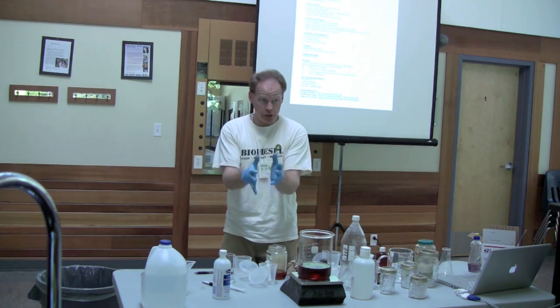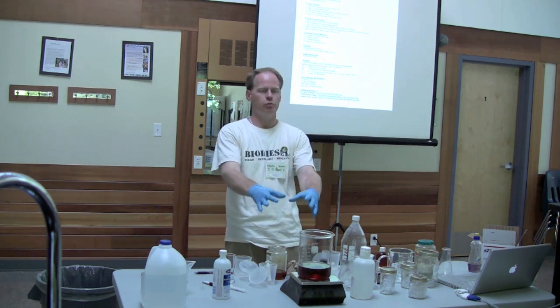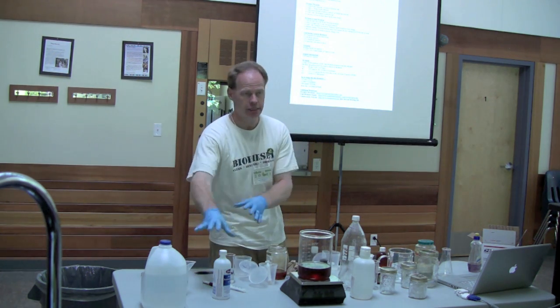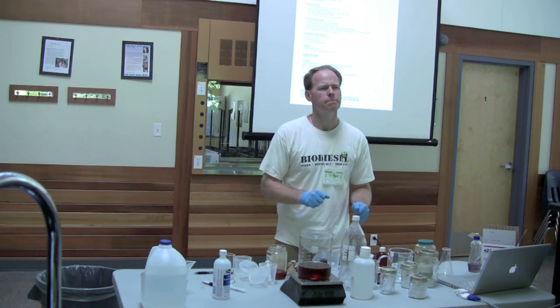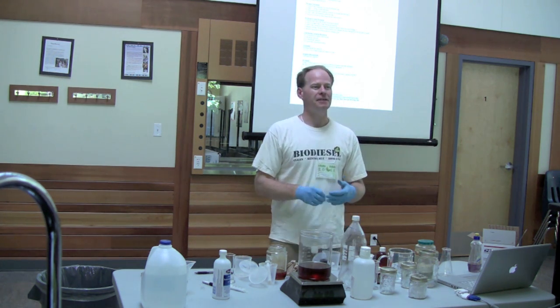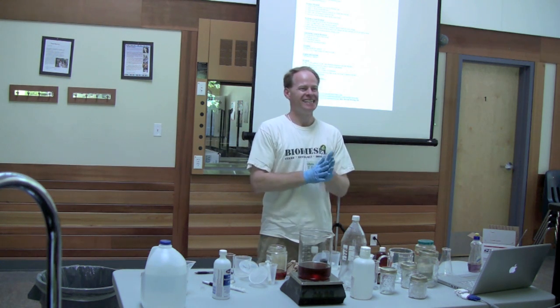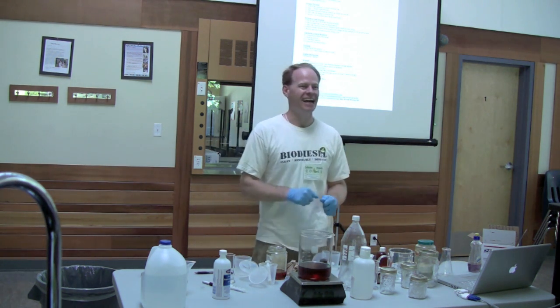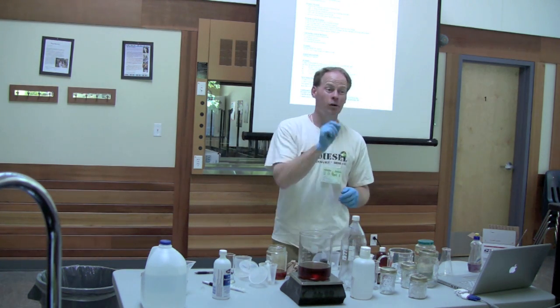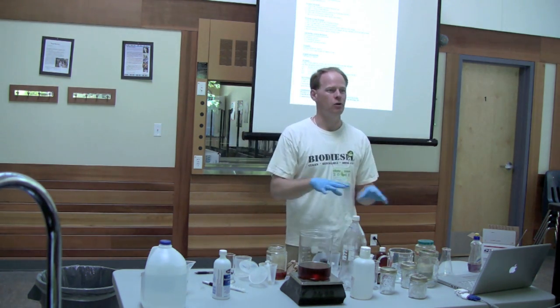You want to be as accurate as you can, but I don't have to be super accurate. I don't have to have a super accurate scale to do it. To make the titration solution, you do. Good question. I'm used to doing lab work in university, where it's a tenth of a mole concentration. This is the stuff we do out in the garage. But you're right, there is a more accurate method to titrate. This is the homebrew method.